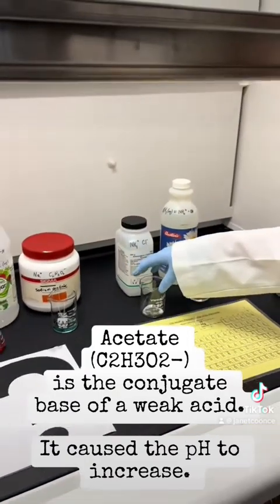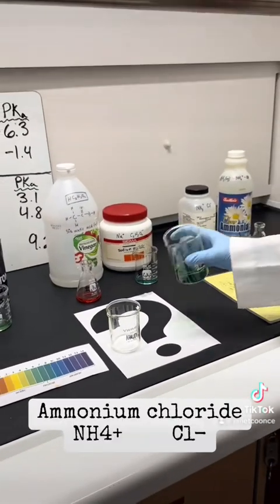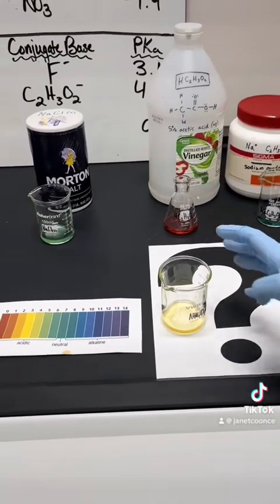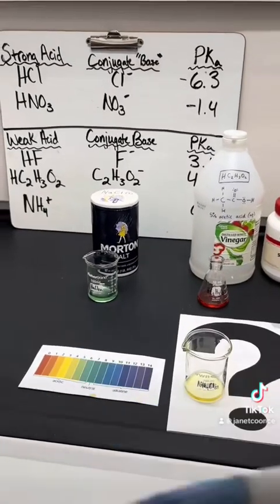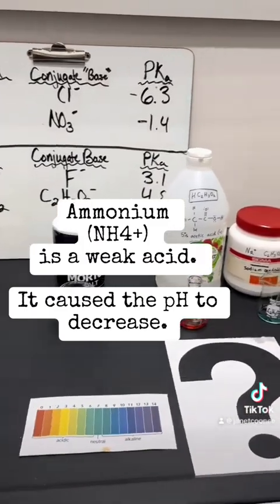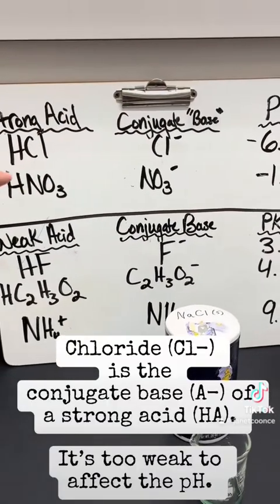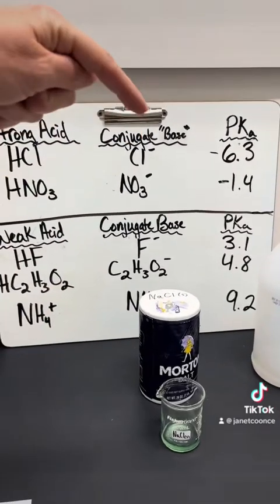So let's keep playing. Now what do we have? All right, so right here we have ammonium chloride, and let's test the pH of it. So we're going to add some water since it's solid. Ooh. And ooh, it's this nice pretty, I guess orangish yellow color. And what we can see is ammonium is an acid, so that is why it's giving us a low pH value. Right, so ammonium NH4 plus is a weak acid, and it will cause the pH to be lower, more acidic, but the chloride is the conjugate base of a strong acid, so the chloride did not change the pH of the solution.